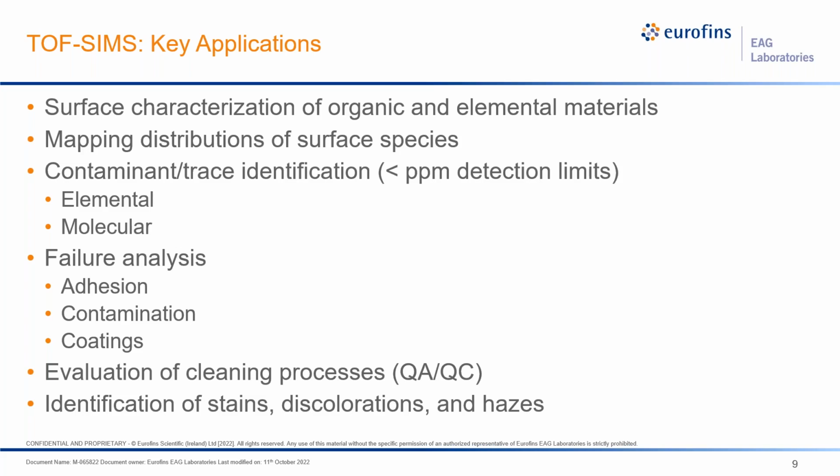We do a lot of failure analysis: failed adhesion, contamination, or delaminating coatings or blistering coatings. A lot of quality assurance and quality control in regard to evaluation of cleaning processes, and then just simply identifications of stains, discolorations, and hazes.